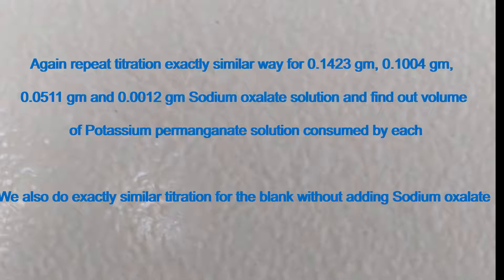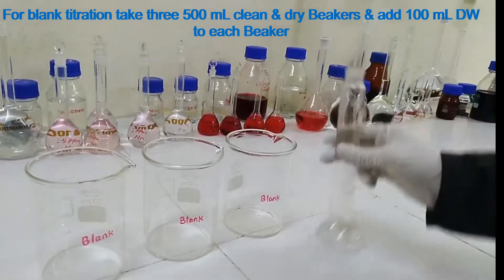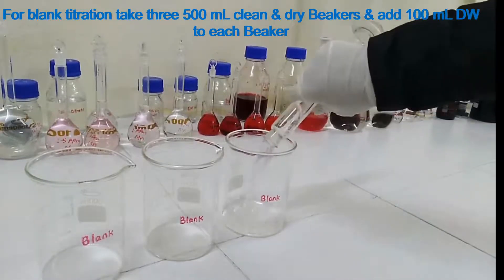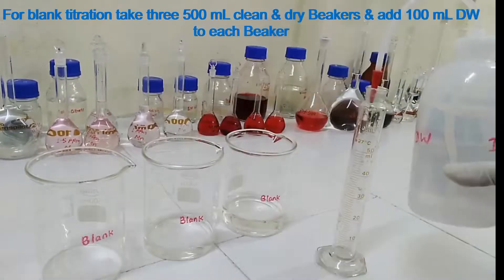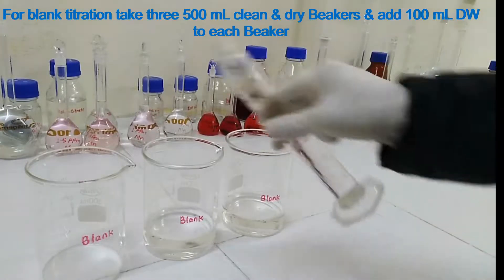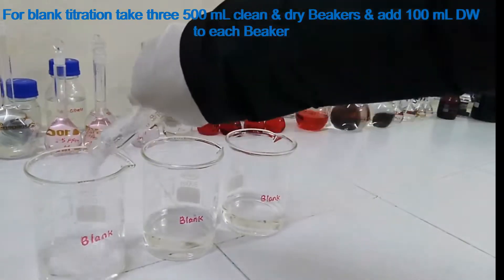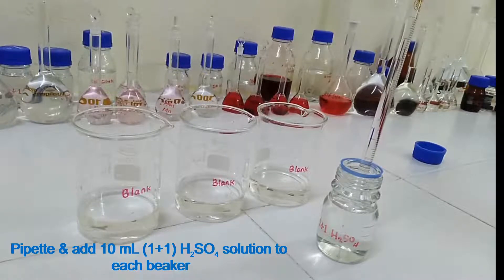We also do exactly the same titration for a blank without adding sodium oxalate. For blank titration, take three 500 ml clean and dry beakers and add 100 ml distilled water to each beaker. Take 1+1 sulfuric acid, shake well, and pipette 10 ml of 1+1 sulfuric acid solution into each beaker.